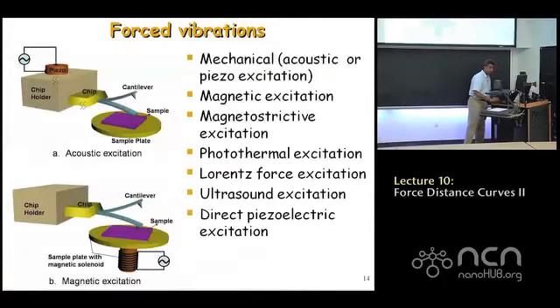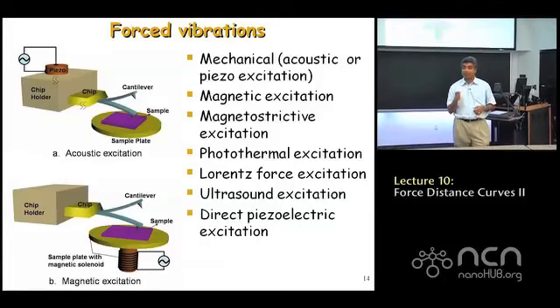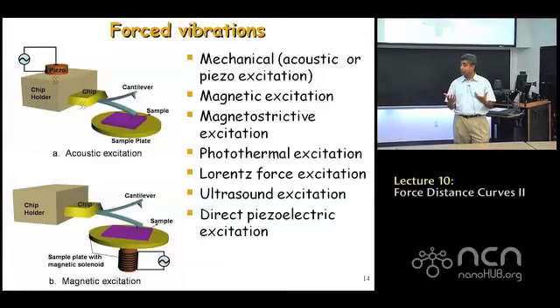And then, of course, there are issues. As we go forward, we're going to look at, for example, how the method of exciting this resonance changes what you observe, and there are many ways of doing it. So we'll consider all this in detail a little later. Just a little brief intro to dynamic AFM, and in the next lecture we'll be looking at calibration methods, and one of the important things we need to calibrate is the stiffness of these eigenmodes as well. So we'll talk about that, okay? Thank you very much.